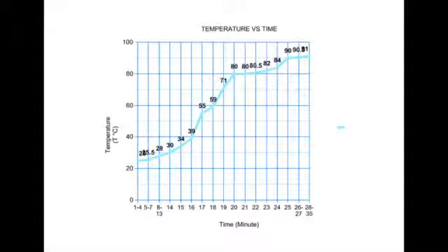As we know, water has a lower boiling point than copper sulfate, so the water becomes the distillate and evaporates first. The water vapor is then cooled and condensed inside a condenser to form the pure liquid, the distillate water. In this distillation process, every minute should be observed to know the exact time and temperature at which distillate water comes out. And during this process, the temperature increases, and the graph of time versus temperature shows that the longer the time, the higher the temperature that is obtained.